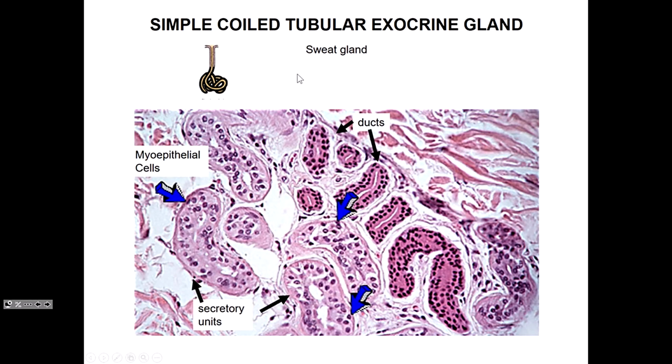so here again, the tubular part of this gland is simple. This is the tube of this sweat gland. Even though it looks like multiple cross sections, remember I talked about thinking in 3D: you've got a tube, you cut through it, it looks like there's multiple pieces, but it's not. It can be just the one duct. So the duct portion is not branched, so that's simple. Here's the secretory portion. Again, it's highly coiled, but it is tubular. So again, it is a simple tubular gland.